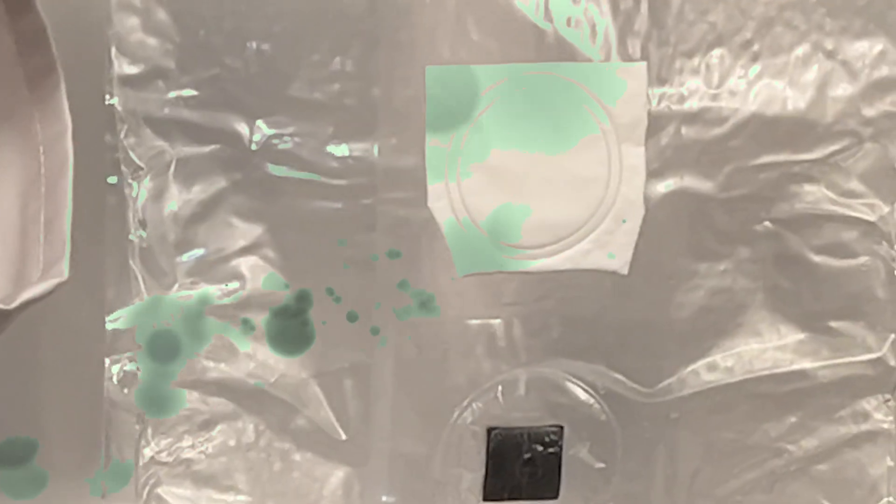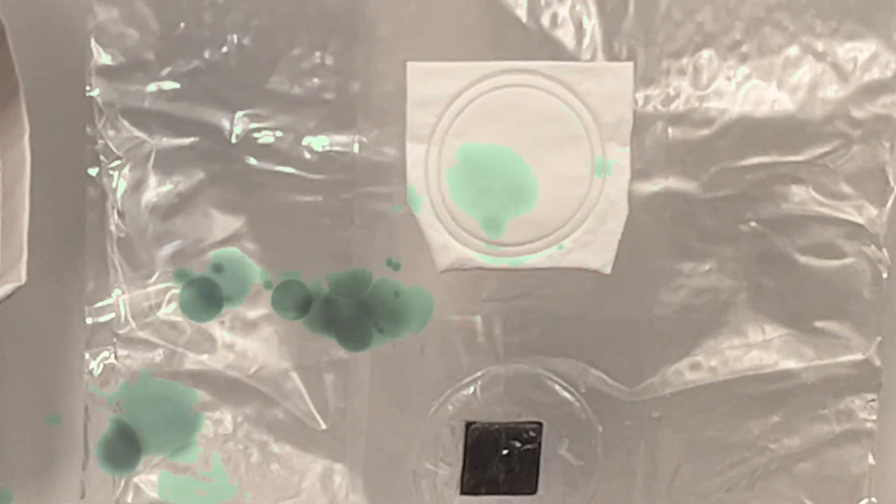The injection port is a sterile access point used for liquid culture inoculation, keeping the bag sealed to prevent contamination in non-sterile environments. The filter patch allows gas exchange while keeping airborne contaminants out. For grain, a 0.2 micron filter is used. The micron size represents the filter's particle transmission rating, meaning anything larger than 0.2 microns won't pass through. Most contaminants in the air are larger than 0.2 microns, making this little patch extremely effective.